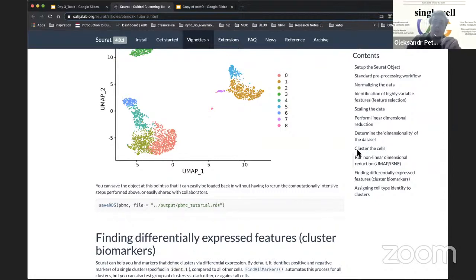If you're mostly interested only in your cells, if you made some specific enrichment experiment and you know what you're looking at, probably just measure the markers you already know, and take a look. You say that you look at whether some particular gene is expressed in one cluster and not expressed in another cluster. How do you do that? How do you estimate this difference, or the significance of expression?